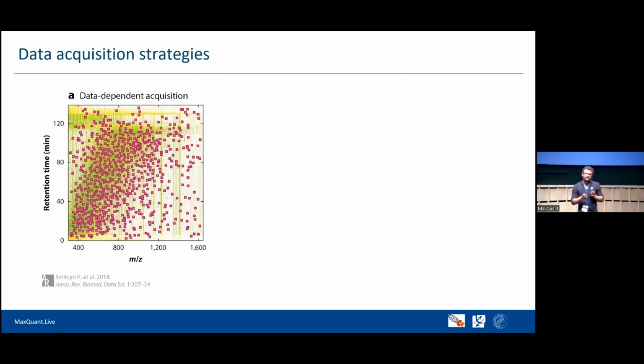They are selected, meaning we use the quadrupole to select a window around these precursors. These ions that are remaining are sent to the collision cell, fragmented, and then get measured. The reason why it's top N is that it makes more sense. You just get more signal, better MS2 spectra, and better PSMs.